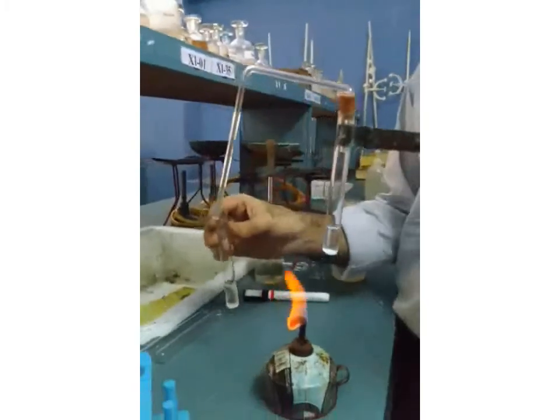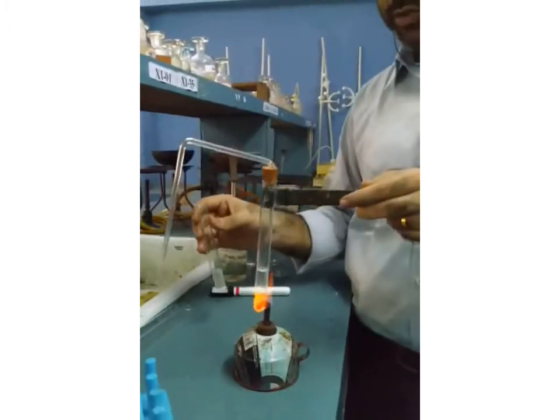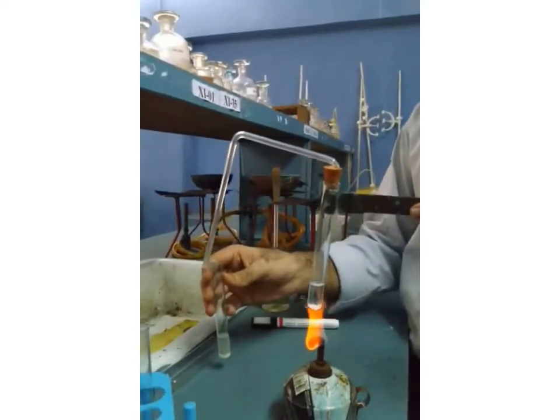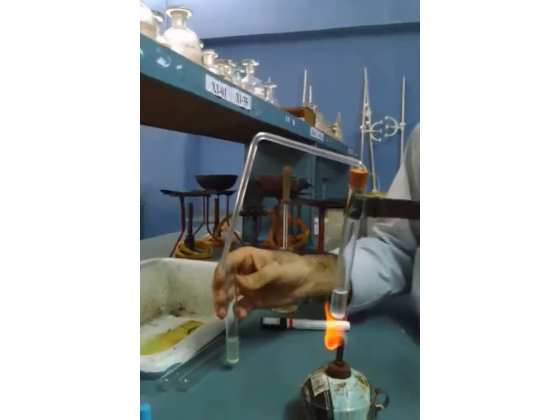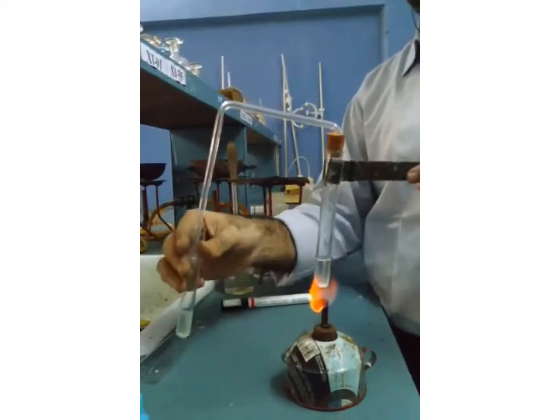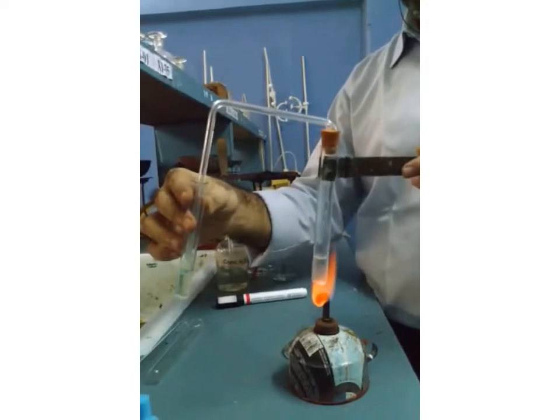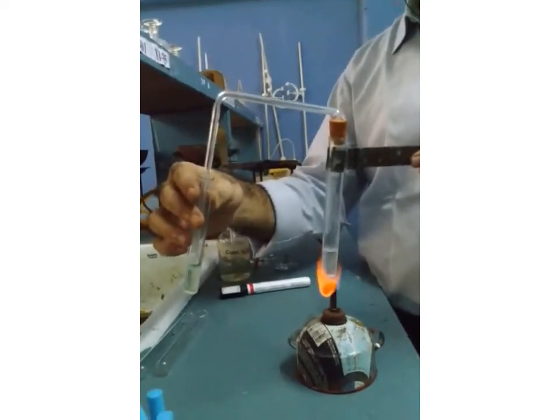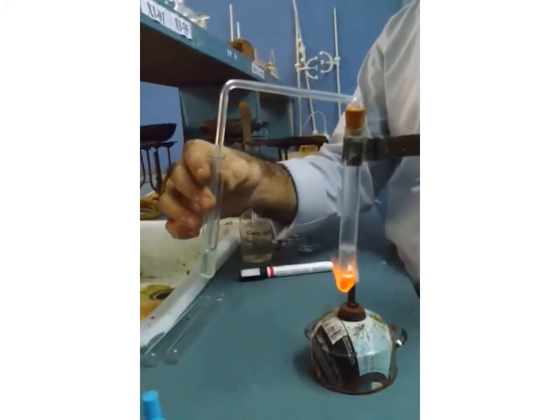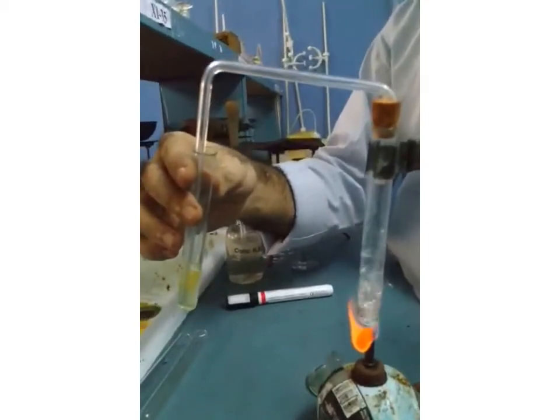When the ammonia gas is passed through Nessler's reagent, it will turn the solution brown. As you can see, the solution is turning brown.